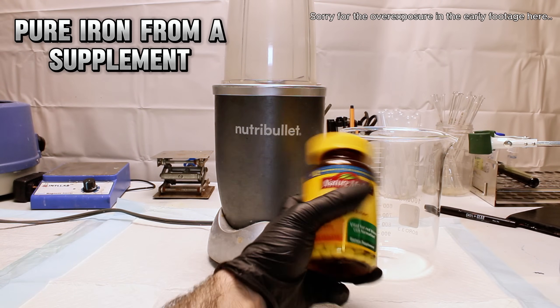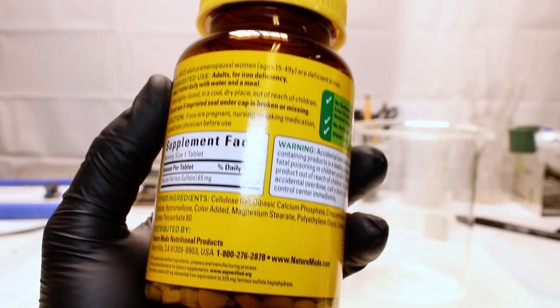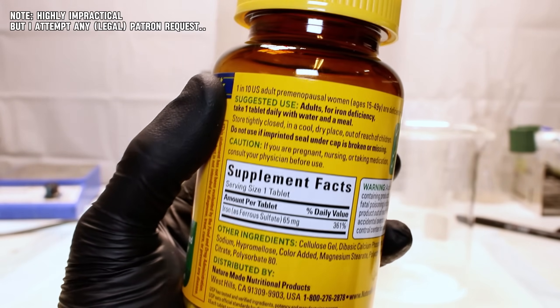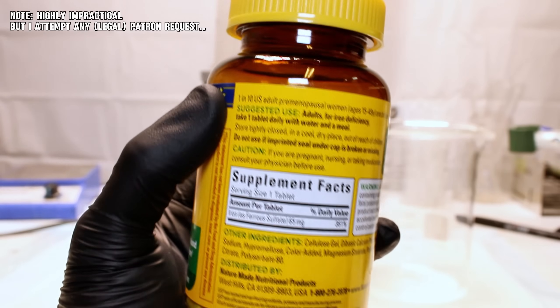Today I'm going to extract pure elemental iron from supplemental iron vitamins, and this is something I'd never normally try to do because of the difficulty involved, but as a patron request I promised I'd do my best.